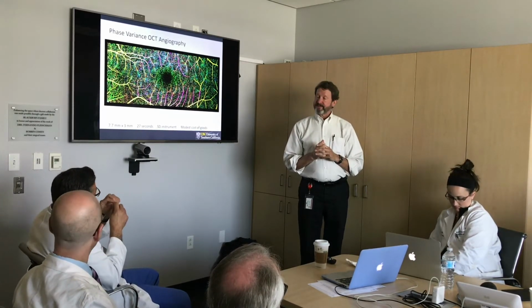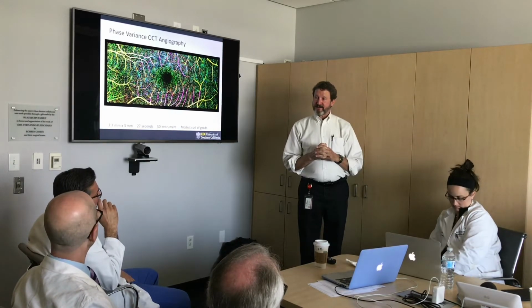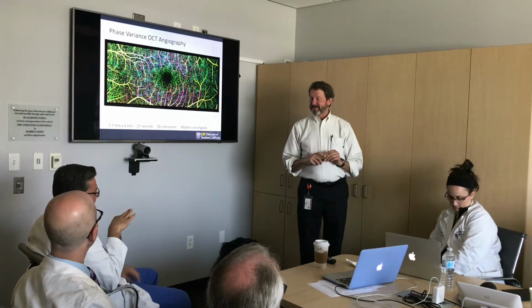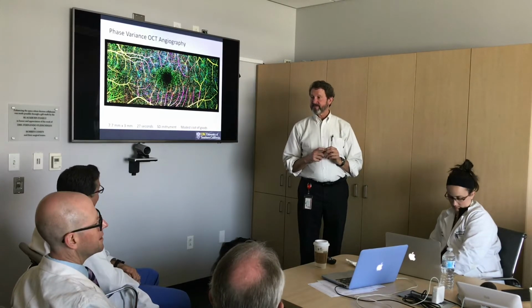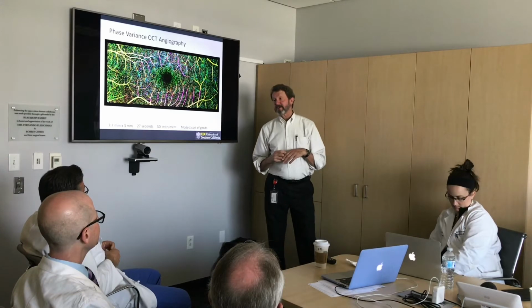Have you looked at any nail beds with? We haven't, but I bet that would work pretty easily. Yeah, because that's the way they used to do capillaroscopy, right? Yeah. Mm-hmm. Yeah, but it'd be fun to just look at a number of different settings.